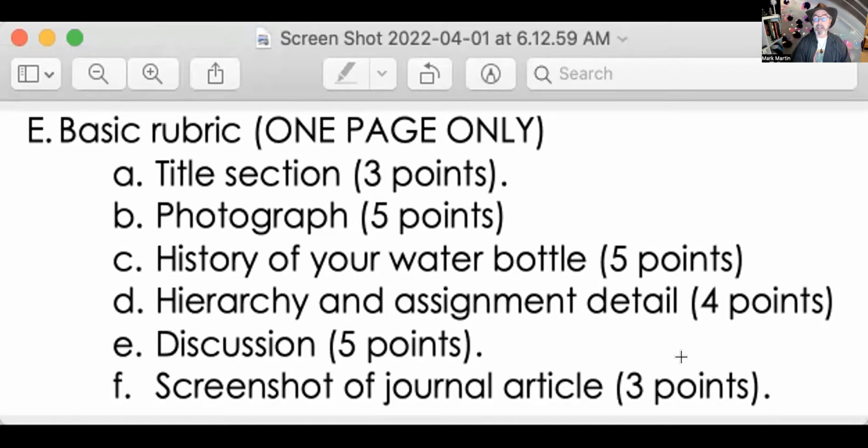Now, like I said, you have an example that's already completed from another class of mine to give you some guidance. You have the formatting and you have the rubric for that. But I also found that some students were a little confused or asking me questions on how best to analyze what they had. And I wanted to take a moment with an example of that. So remember, you have two isolates with your number and your letter after them. And the first thing that I asked you to do is to look at those chromatograms. And so here's an example from your class.